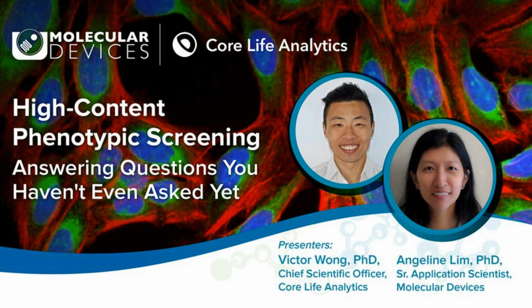Thank you, Angeline and Victor, for your informative presentations. We will now start the live Q&A portion of the webinar. If you have a question you'd like to ask, please do so now. Just click on the Ask a Question box located on the far left of your screen. We'll answer as many of your questions as we have time for. So let's get started. Our first question is, do you have to use confocal imaging for cell painting, and what about wide field microscopy?